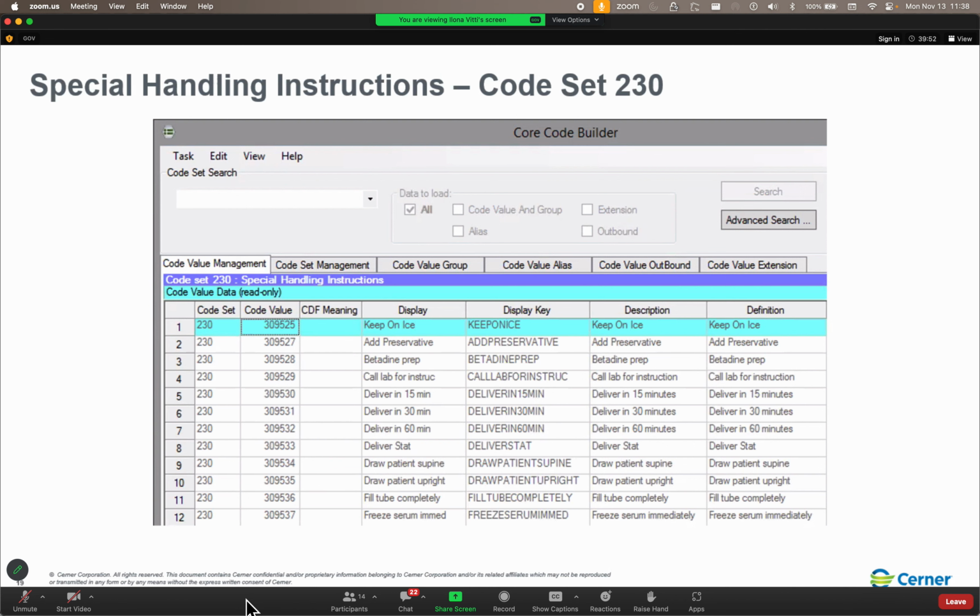So for my non-clinical folks, aliquots are where we pour off a little bit of the specimen into a separate container, because maybe we're running most of the specimen in the lab, but part of it's going to be sent out to a reference lab. So that's an aliquot. Now, the reason why we check that it is an aliquot is because when we go to build our collection requirements, non-aliquot containers will show up in one place, aliquot containers will show up in another place. So an aliquot container cannot be a parent container and vice versa.